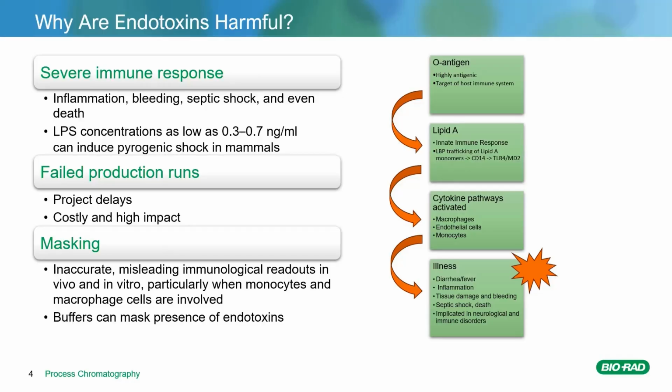Beyond the potential to harm patients, endotoxin contamination can result in significant processing delays and product recalls. Even at the discovery and research scale, the presence of endotoxins in biomolecules can have a negative impact, leading to false immunological readouts and conclusions.